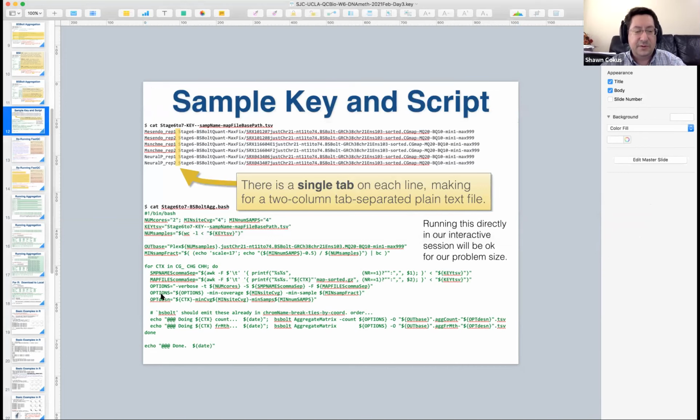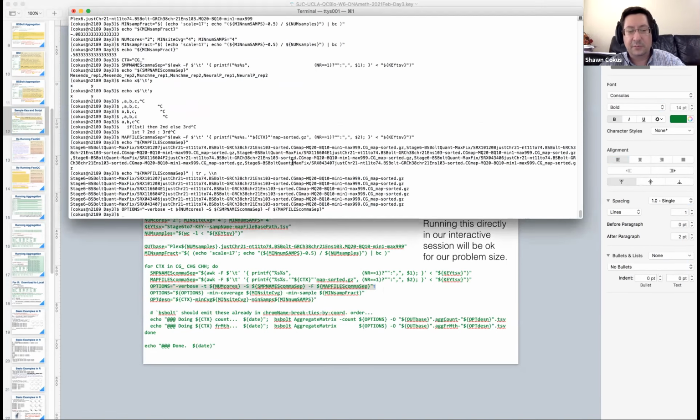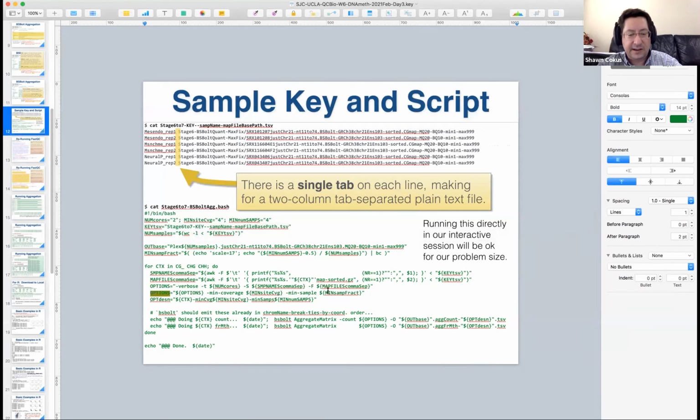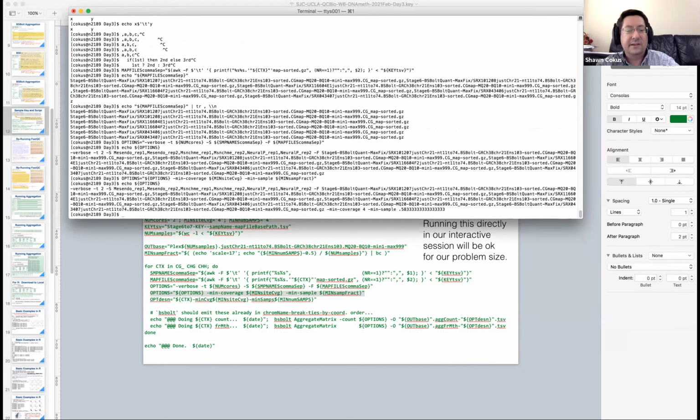And then we've got to build this BS-Bolt command line, and at some point, making all of your shell script lines get ridiculously wide is also problematic. So sometimes I just use shell variables as ways to build up what would have been really long lines in the shell script. So options is the start of the command line options to the BS-Bolt aggregate matrix. There's our dash verbose, dash T2 cores, our dash sample names, our dash file names. And then we're going to add some more to that. So we set options to be options followed by some more stuff. We're just making it longer, but I didn't want the line of text in my script to get longer. So it's just a way of line wrapping in the script, really.